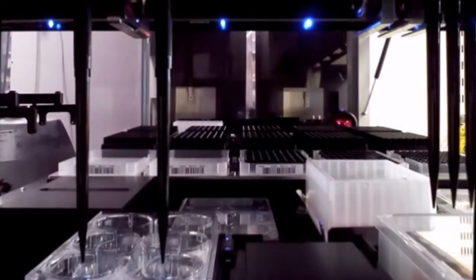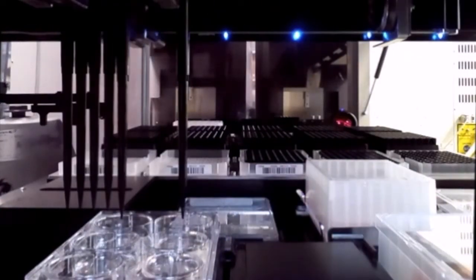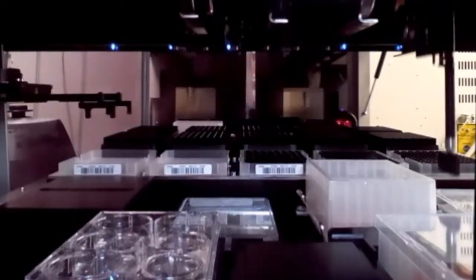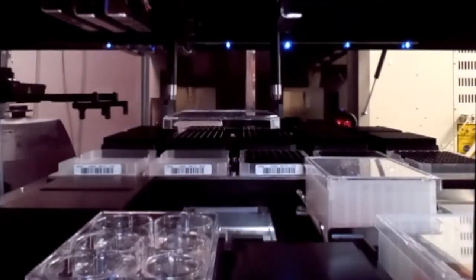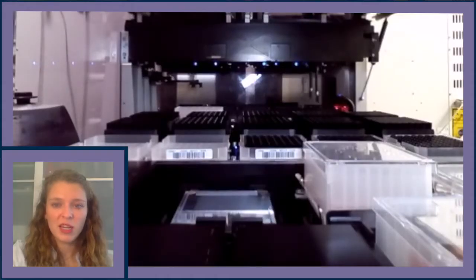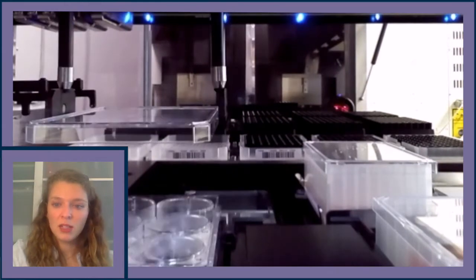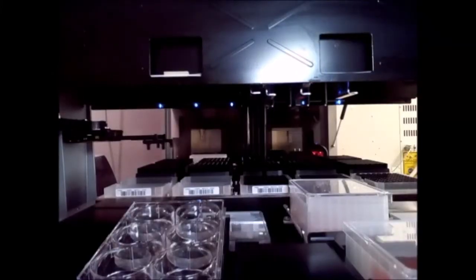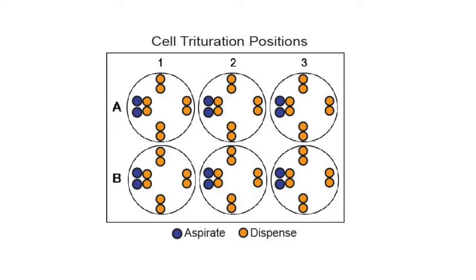After all wells have had media replaced with two milliliters of DPBS and the wash is complete, all DPBS is removed and dispensed into liquid waste. The accutase has been warming on the CPAC and is now ready to be added. New tips are picked up, the tilt module lowers the plate, accutase is aspirated, and one milliliter of accutase is dispensed into each well. The plate is then re-lidded and moved to the other CPAC set to 37°C, where the plate warms for four minutes as counted by the method.